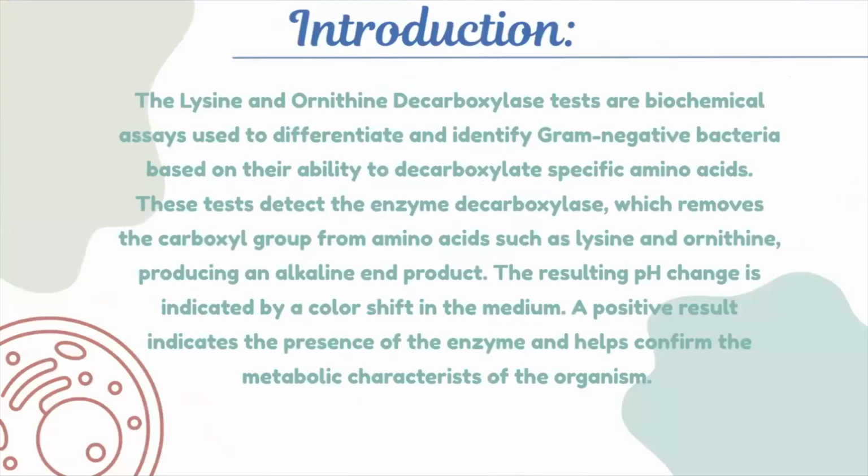Introduction. The lysine and ornithine decarboxylase tests are biochemical assays used to differentiate and identify gram-negative bacteria based on their ability to decarboxylate specific amino acids.